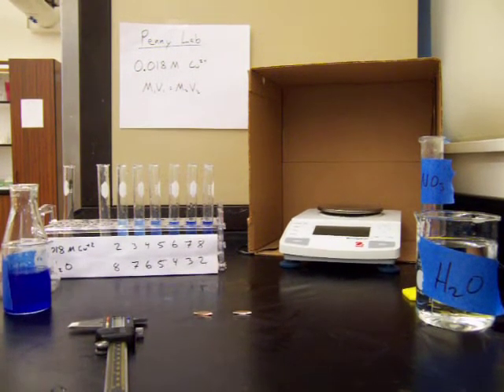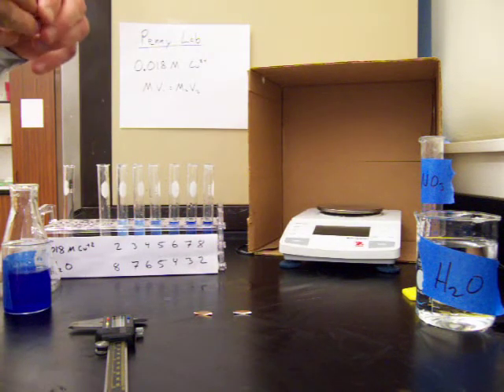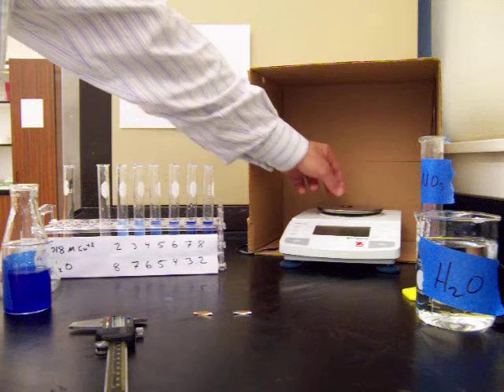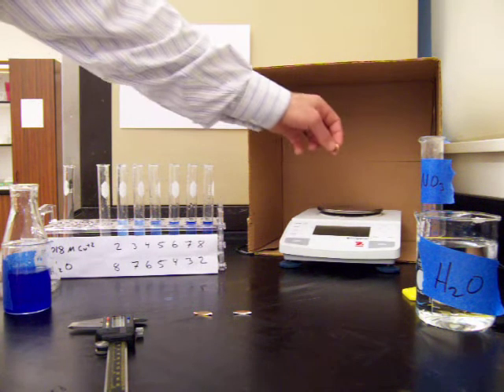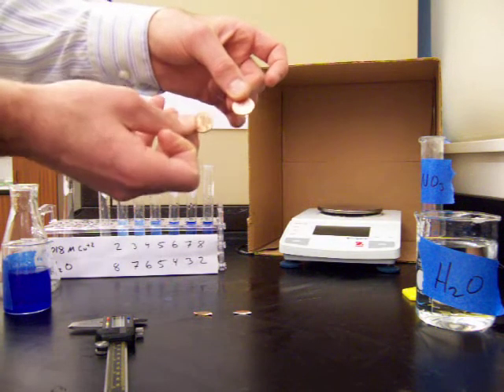This is the penny lab where we're going to be determining the thickness of copper on a penny. I have two pennies here, one's an older penny and one's a newer penny. The older penny has a mass of 3.10 grams, and the newer penny has a mass of 2.44 grams.